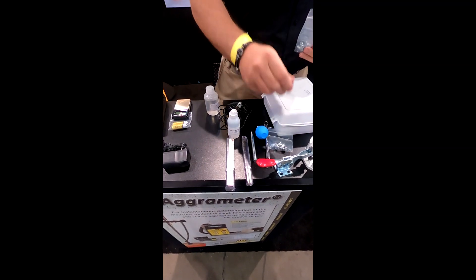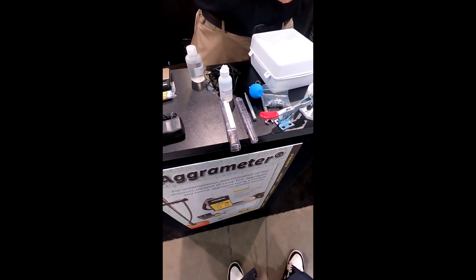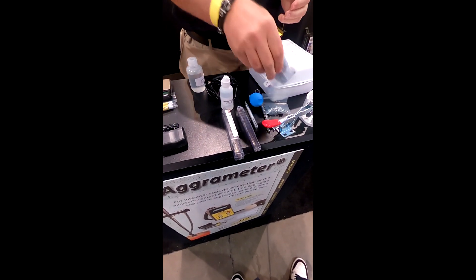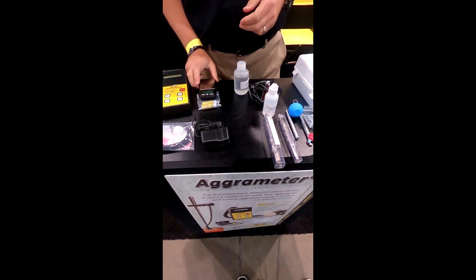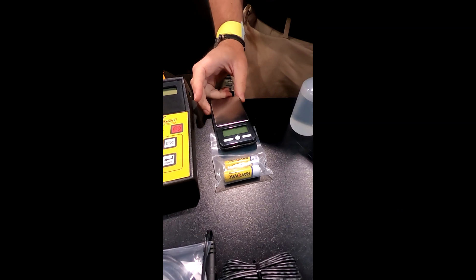This tool here is designed to set the anchor in place. We also have a little scale, which will allow you to weigh out the 3-gram sample.